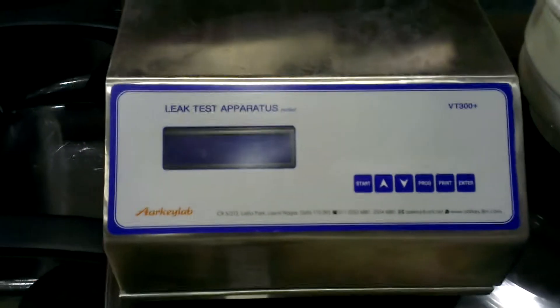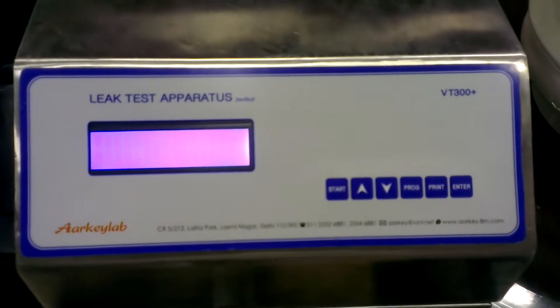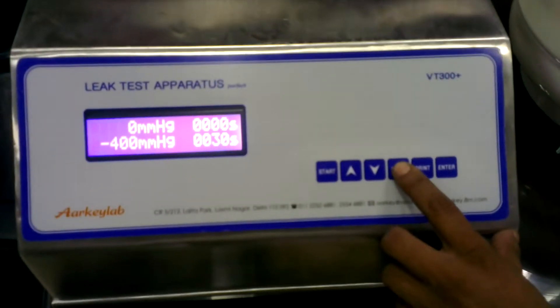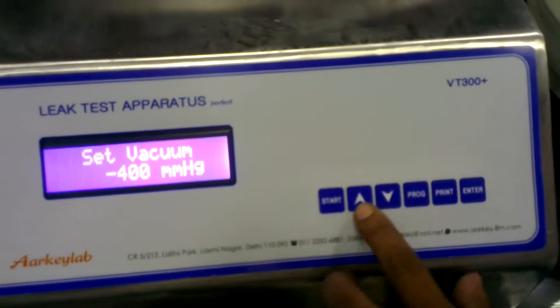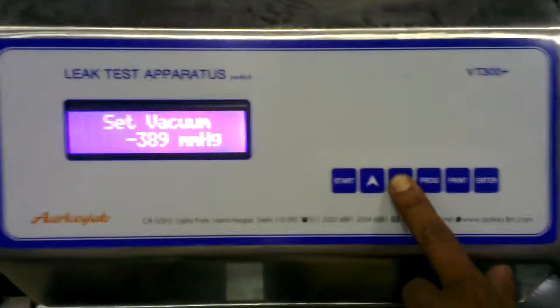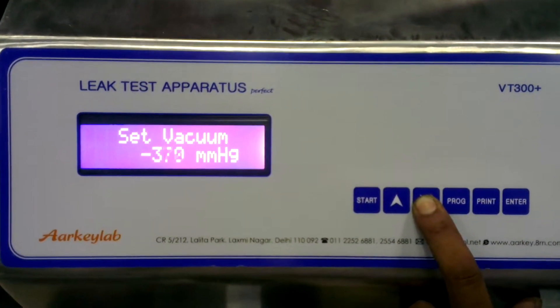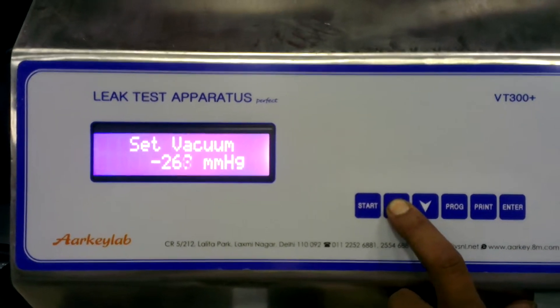Let's change the power of the bench. Set vacuum to any desired value, say 300.